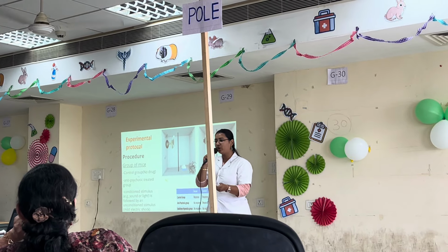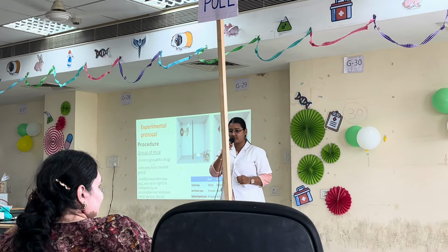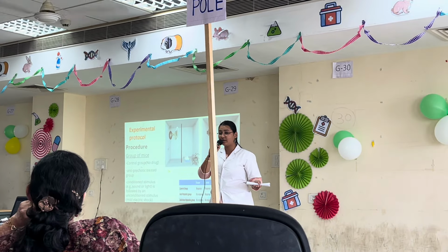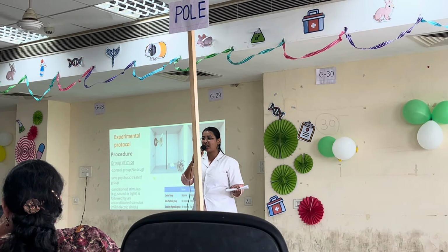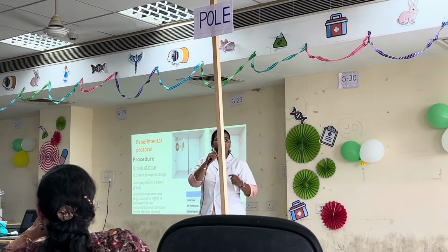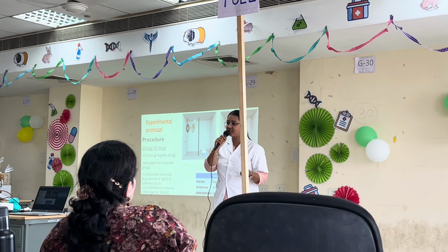So the 4th part of the training phase. There was no current this time, but the mouse still climbed. This proves that the mouse has been trained and this was a conditioned response. Now we're going to check how the mouse responds with different drugs. So first is the control study.